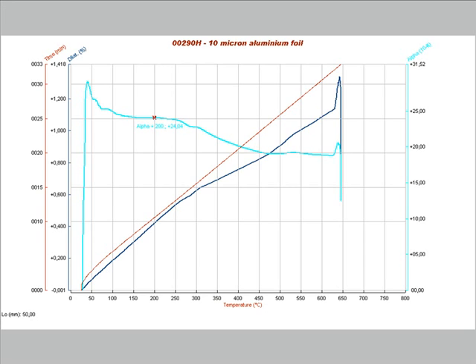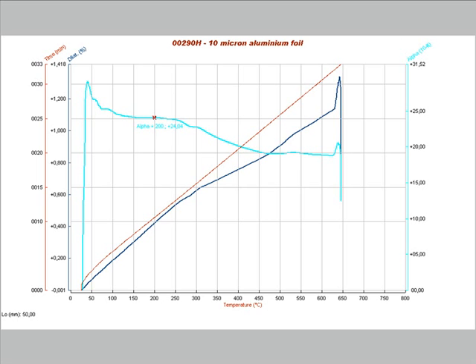This is the outstanding result of the measurement on an aluminum foil, with a thickness of only 10 microns. Up to 250 degrees centigrade, the aluminum expands, with an average thermal expansion coefficient of 24 by 10-6. After this temperature, there is a process of volume reduction, which is caused by the rearrangement of the internal structure, stressed by the cold rolling.